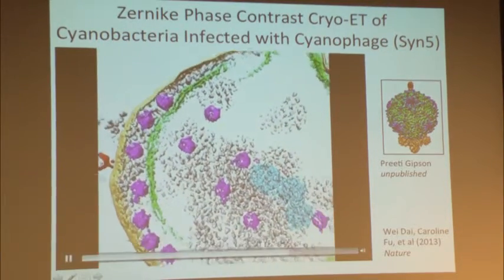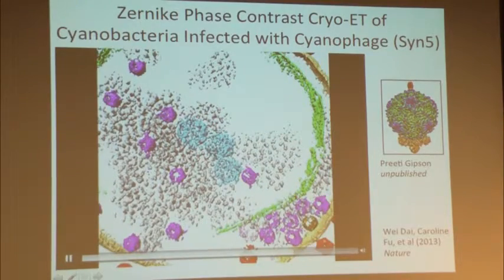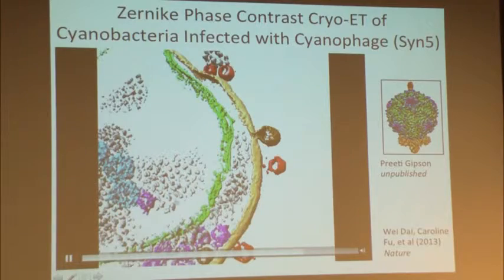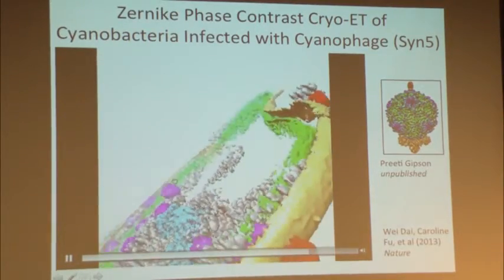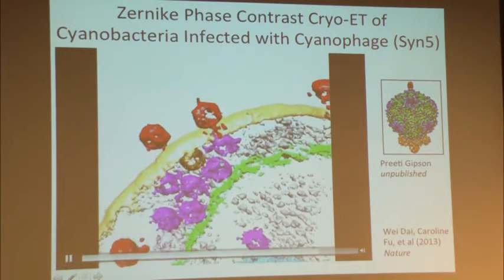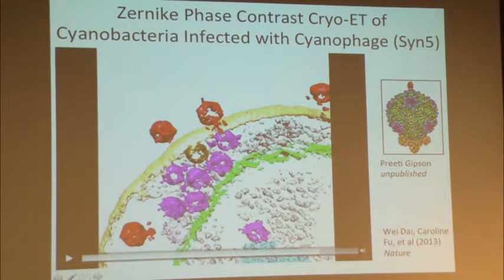And you can see in here, I'm going to show you one particular phage particle, which is very interesting because right here, it looks like there is a density penetrating through the cell wall of the bacteria.